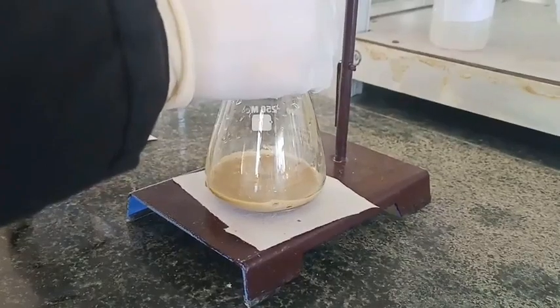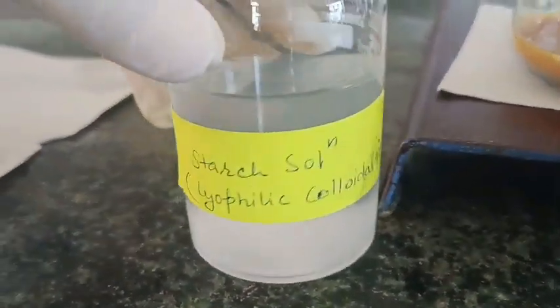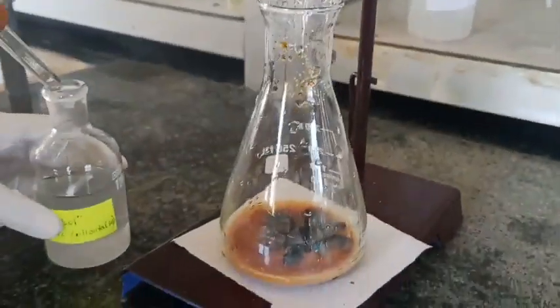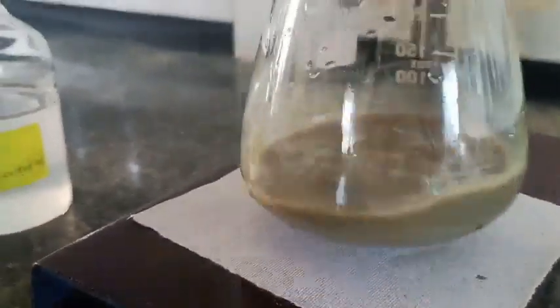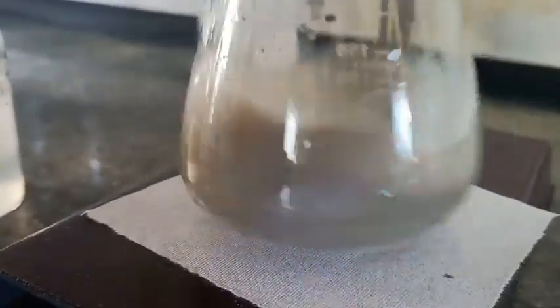Now I am going to add the starch solution which we have prepared freshly, and you see the purple color complex of starch iodine. Now again start the titration. So here you should be very careful, and this is the end point.